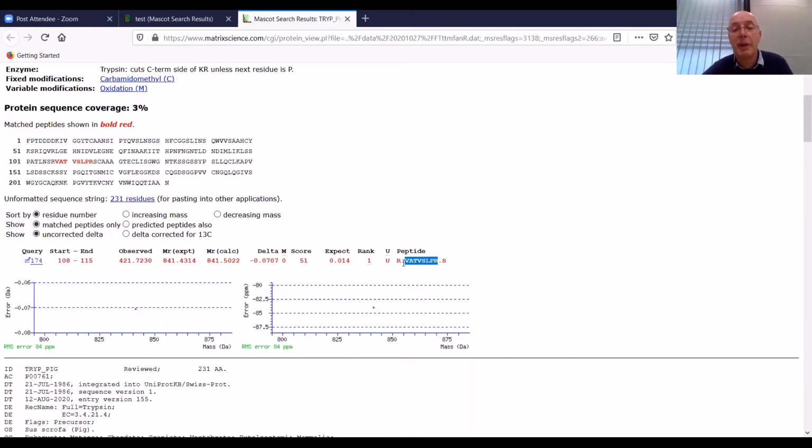So it's not that the mass spec is wrong. The mass spec is absolutely correct. The mass spec identified the correct peptide. It just so happens that in this big Swissprot database, there are 2 peptides from unrelated proteins that are identical, but that's extremely rare.